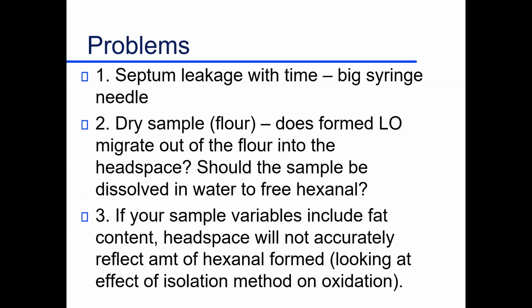Maybe that powder, typically analyzed as a powder, should be dissolved in water. If it's dissolved in water, you completely break down the structure of that spray dried powder, and you know that hexanal is going to come out and it's going to be measurable. So again, the idea is to solubilize it to make sure hexanal is released. Should it be left as is?